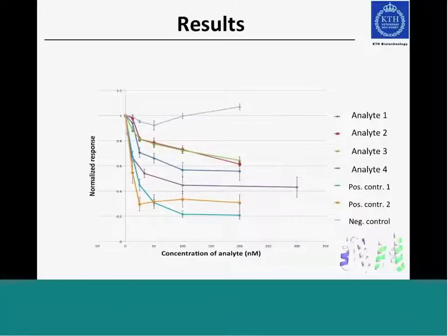This is hard to explain, but we tried also with an ABD here to increase the concentration even further and see if we could cancel out more, but that was not the case. So clearly this is an application specific for this assay, and it could be further evaluated with a different target on the surface or something like that. But the results are very nice, and clearly you can very reliably say that our candidates are actually binding to this epitope, and binding to probably the same epitope, since they are very similar in sequence.